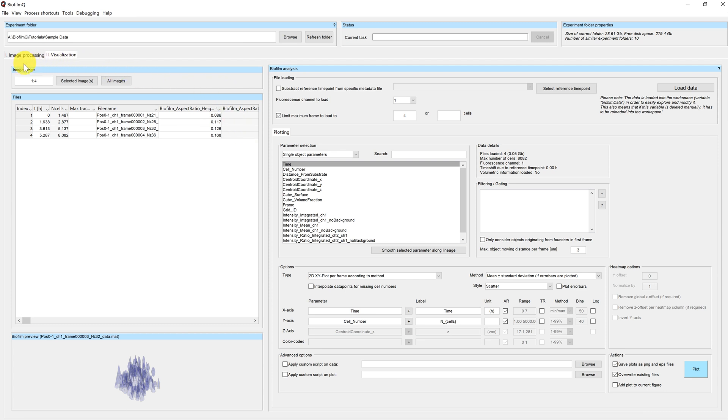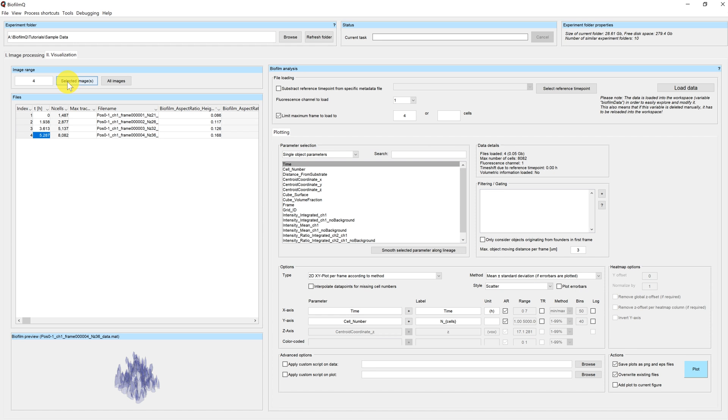Up here I can choose my image range. This range will determine which images contribute to the plot. So if I only want to plot one specific time point, I can select an image and by clicking on selected image, choose this time point here.